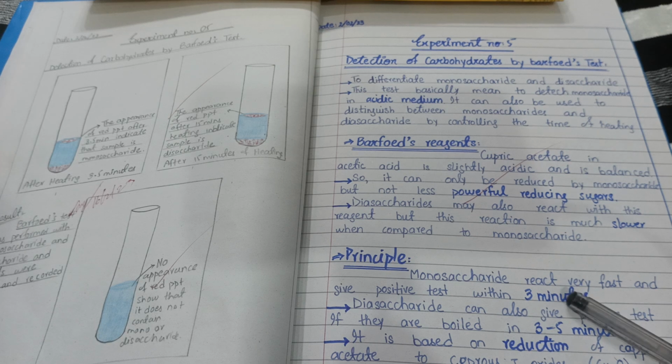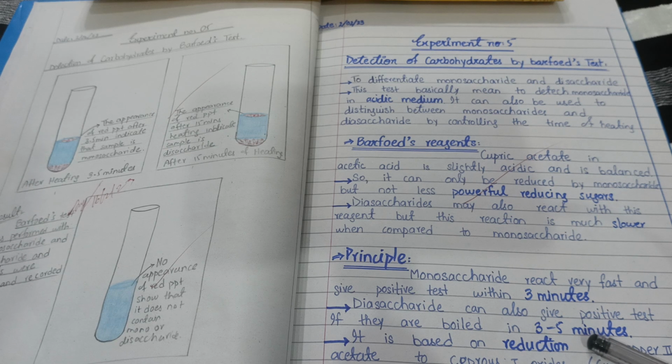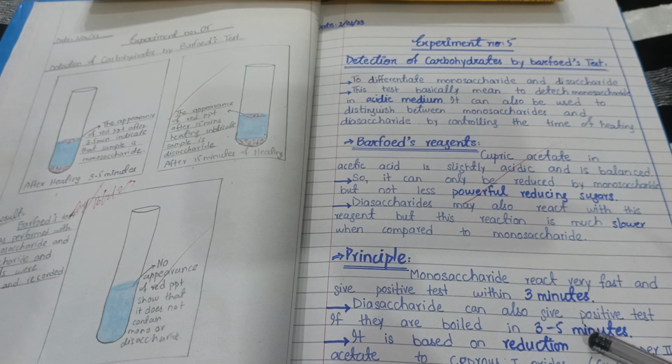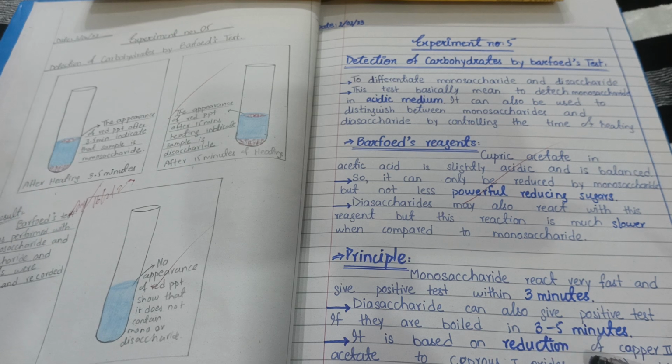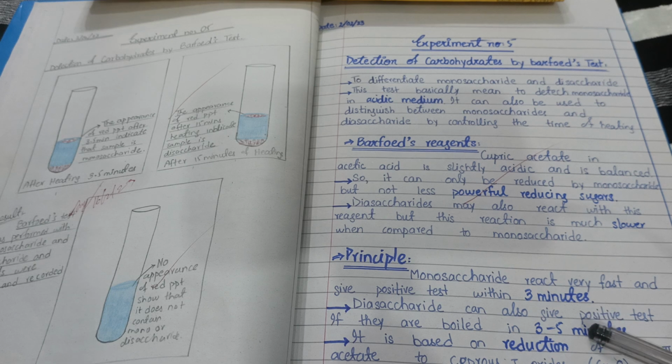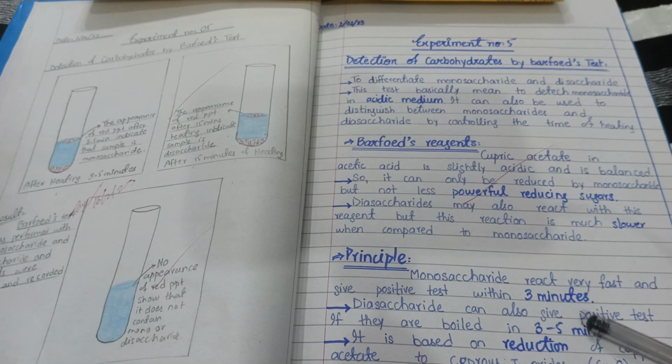So the principle of it is that your monosaccharide reacts very fast and gives the positive result in just 3 minutes, but your disaccharide also gives the positive test, but it takes a longer time. They will take 3 to 5 minutes. So basically it is a reduction process, and the only difference between them is that both of these compounds give a positive test, but with a difference of time. So when you perform this experiment, you need a stopwatch for it.